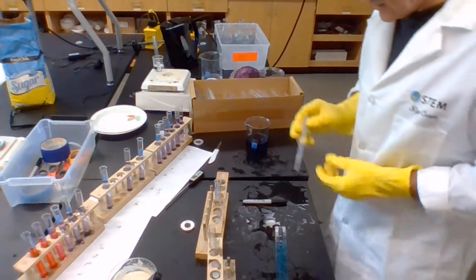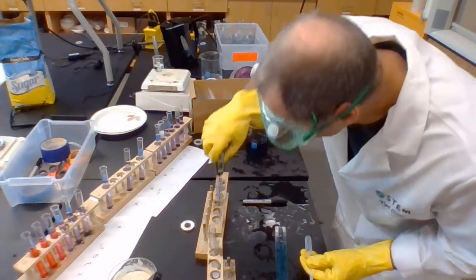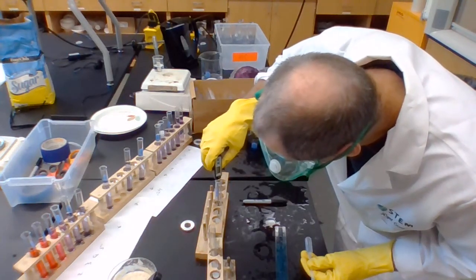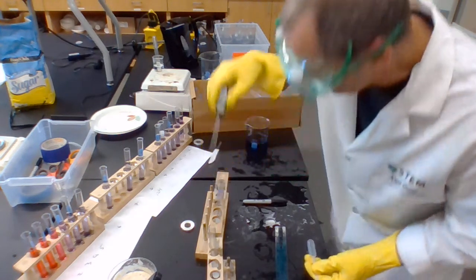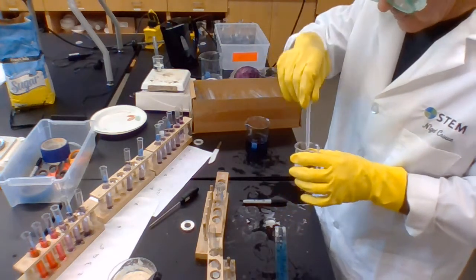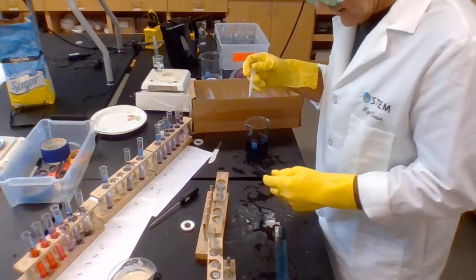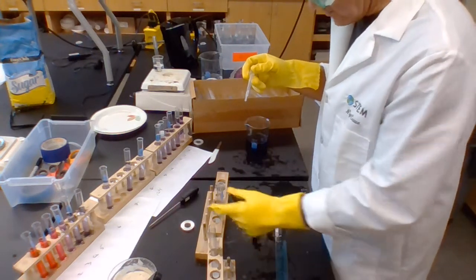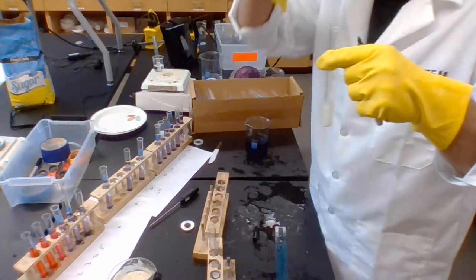So, what I intend to do is this. I'll just check that that's the right one. Good, so that's 23 point something or other now. I'm not waiting for it to happen. What I'm going to do is stick some of this in, which is the hydrogen peroxide. Here's the yeast, which has got the catalase enzyme.